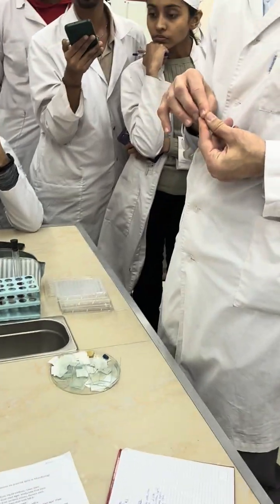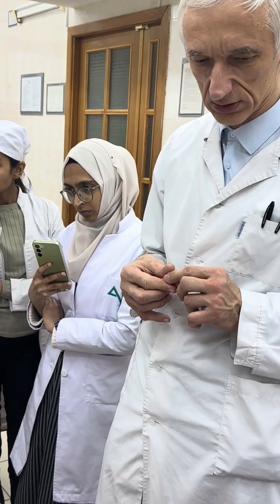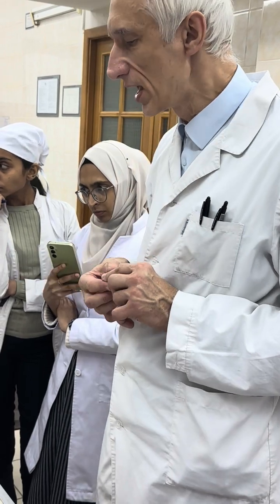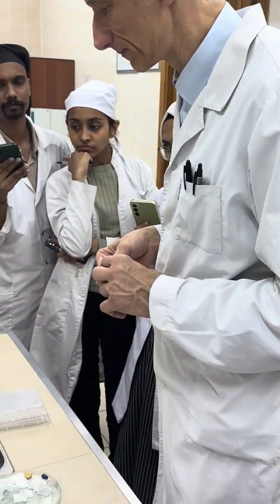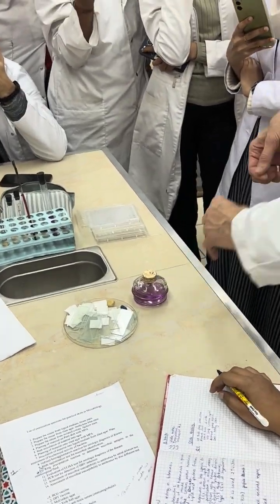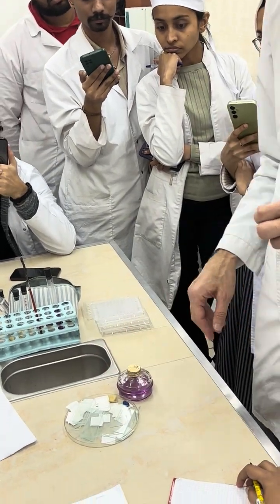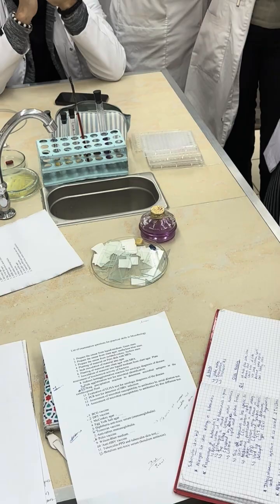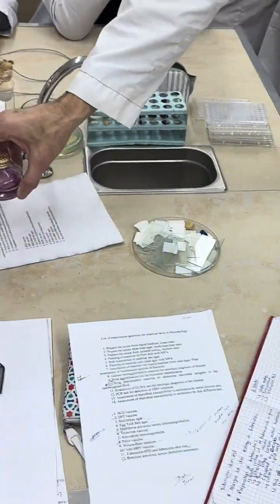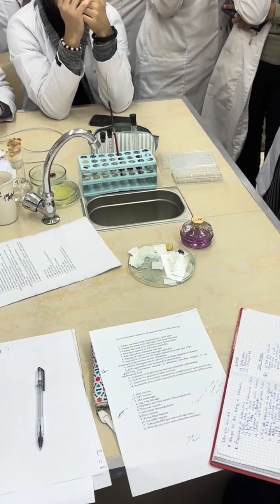So people, as I said already, videos are presented on the distance learning site for all our practical manipulations. They are without linguistic oral comments, so you may simply look. In this video, for example, it is indicated that the position of the spirit lamp should be 1 palm in width from the edge of the table. But again, it depends, as you like. As I said, if you need to move closer, move and light again. Of course, it should not be far away from you, stretching through the whole table. Everything should be done for you.